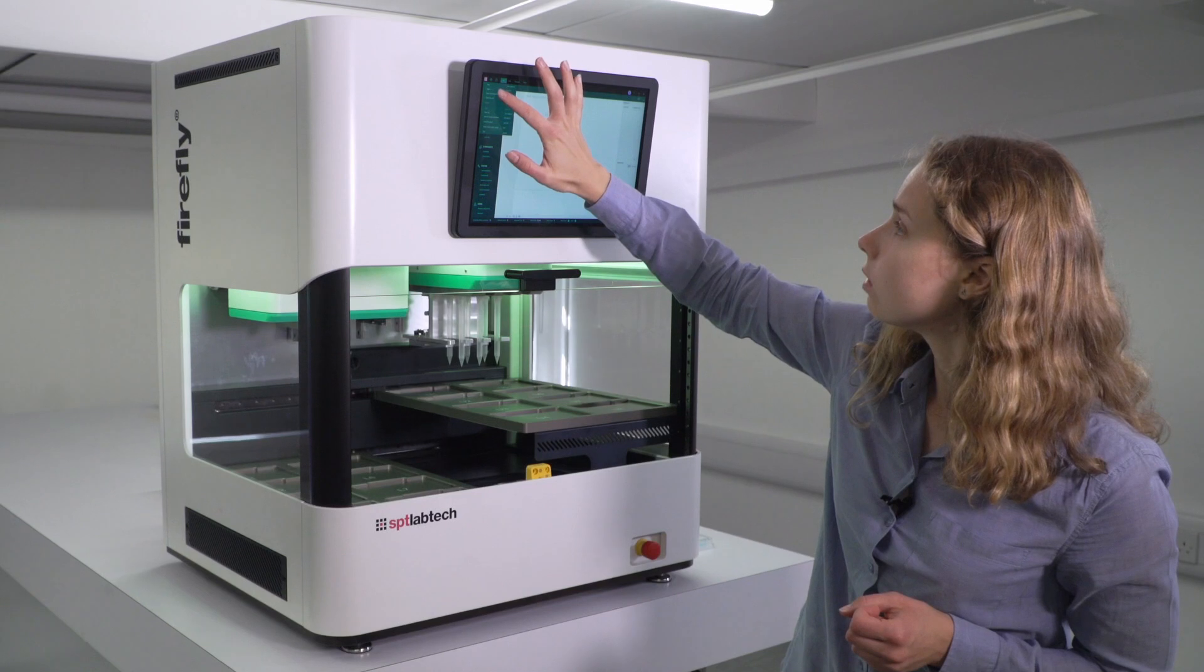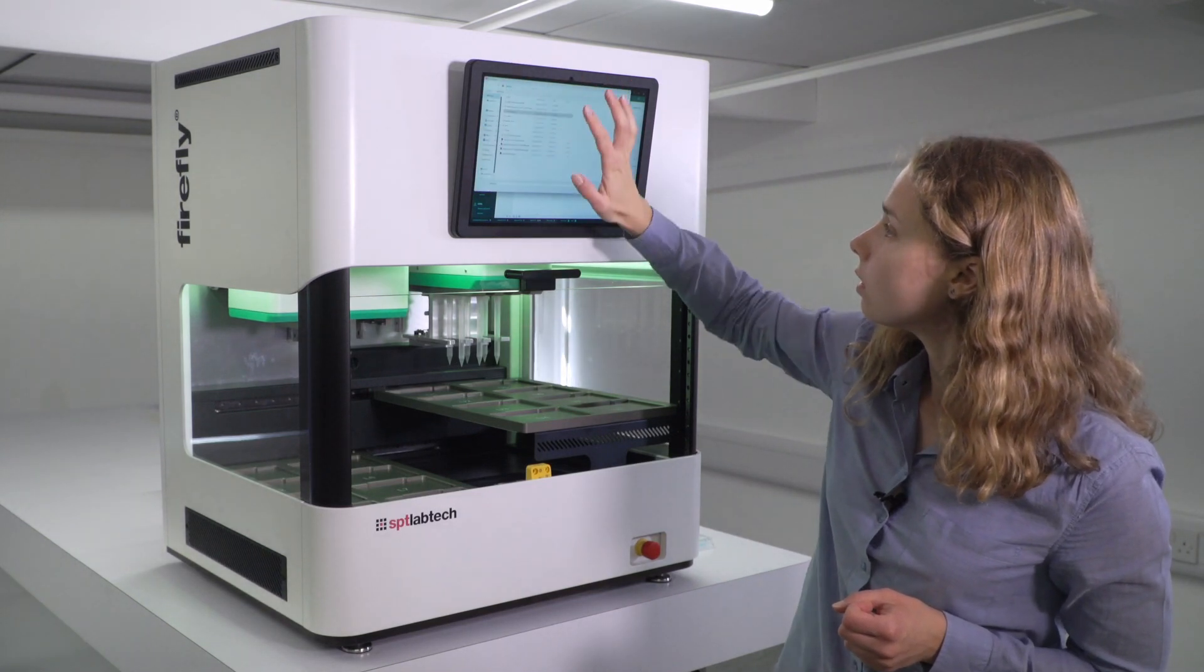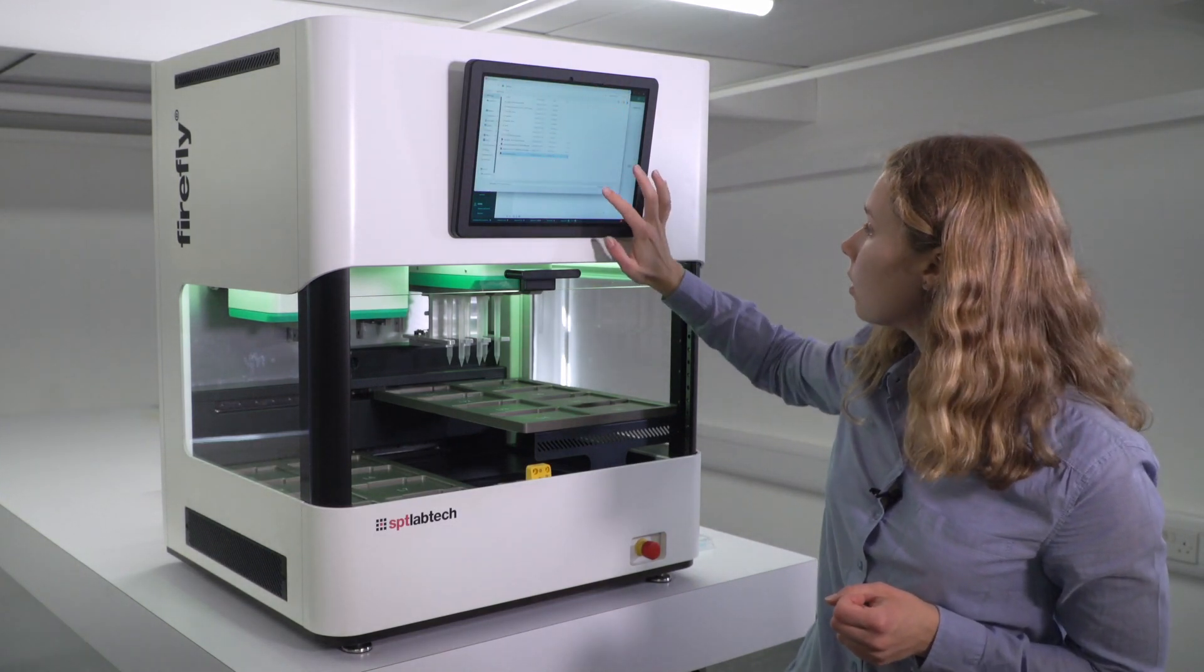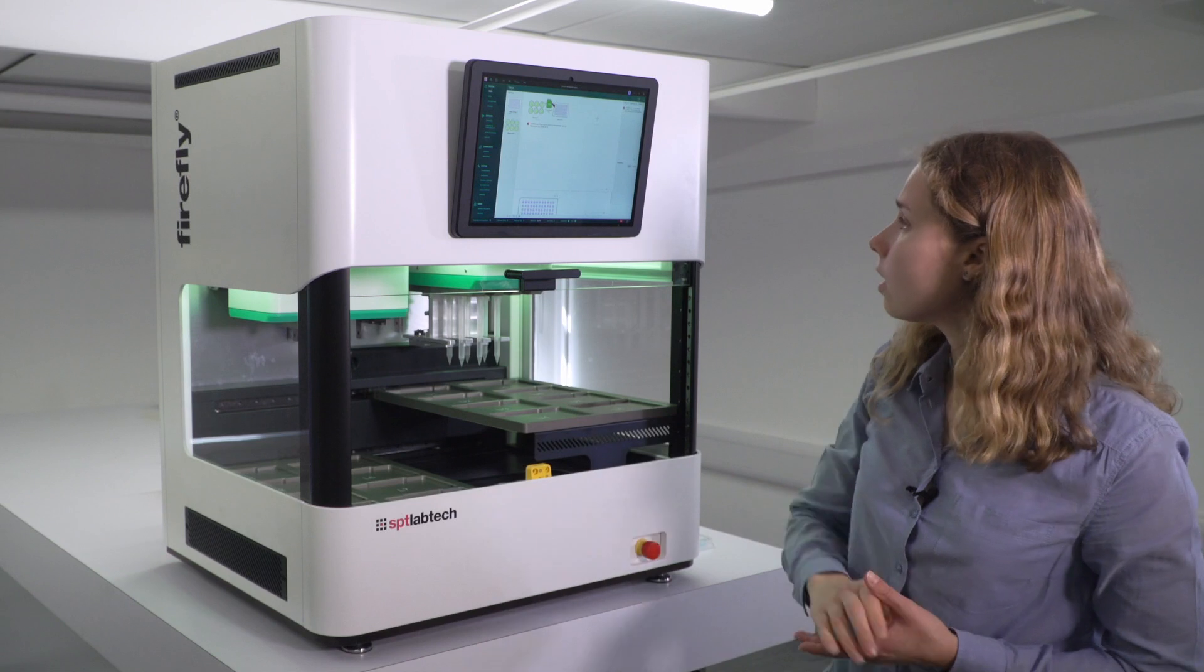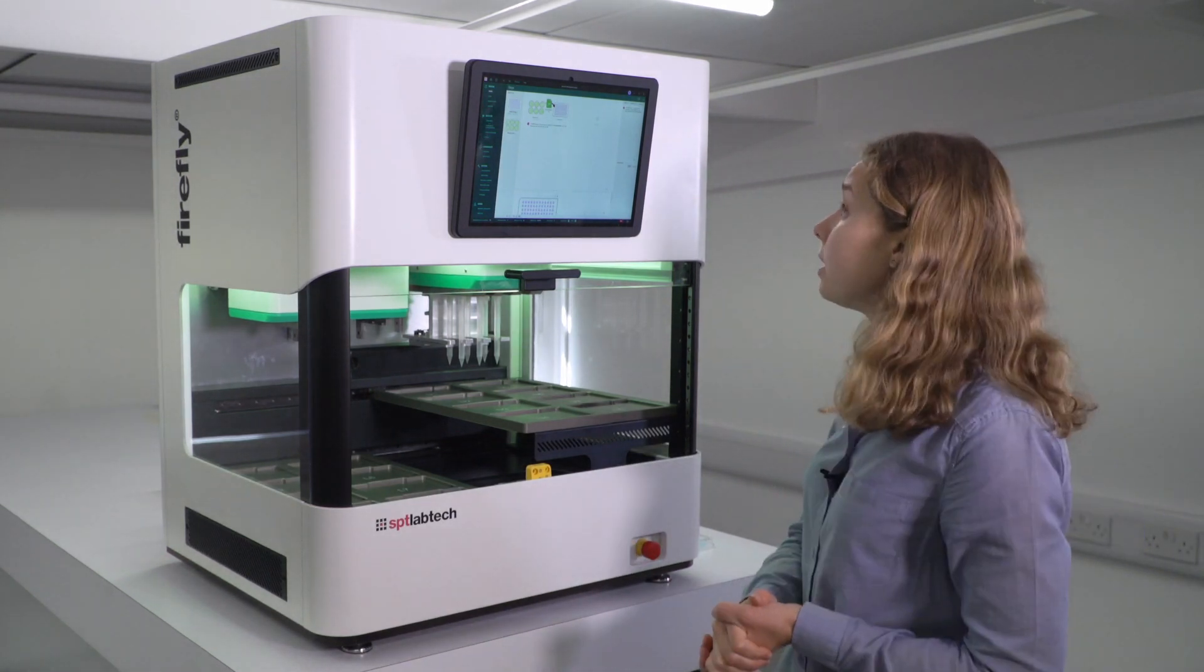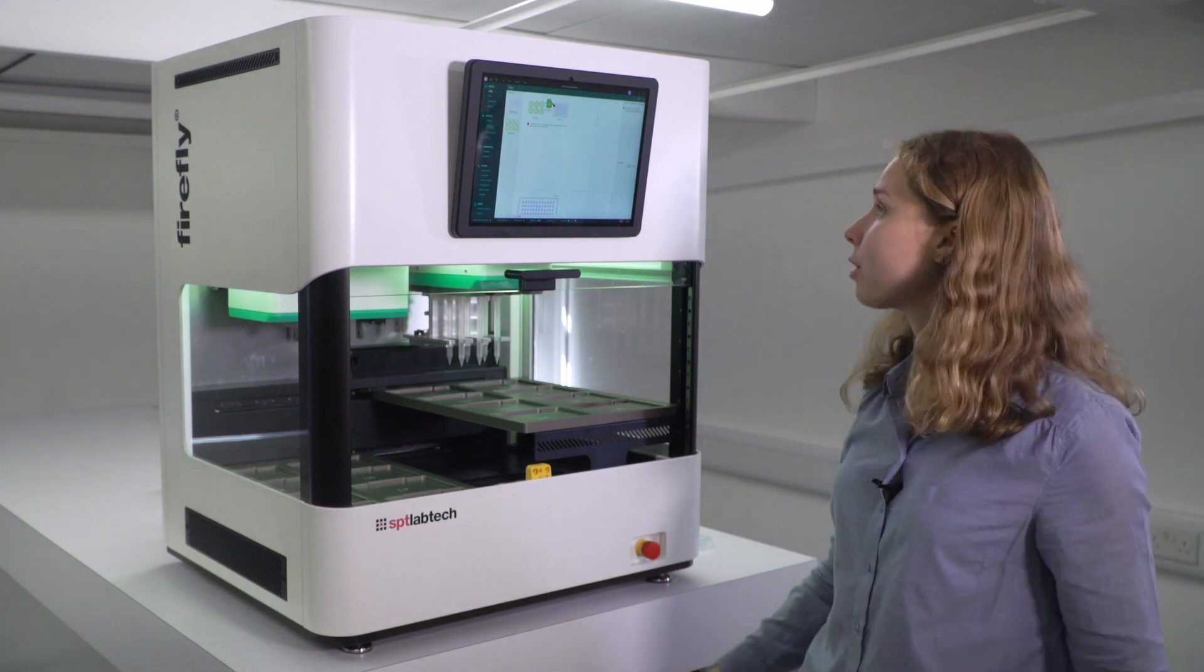So I can open it like this. And now we can see that the protocol has appeared and you can see all the steps that are included in the protocol.